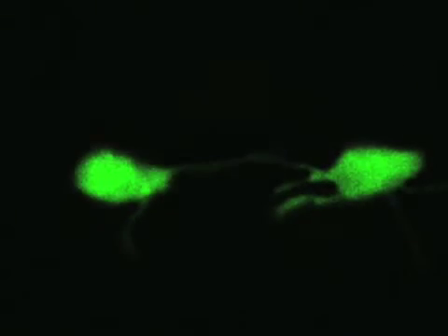We use this technique in our lab to study various aspects of cortical development, including progenitor divisions and neuronal migration. This technique can be particularly useful coupled with time-lapse microscopy, so you can follow individual cells as they divide and migrate in your slice culture.